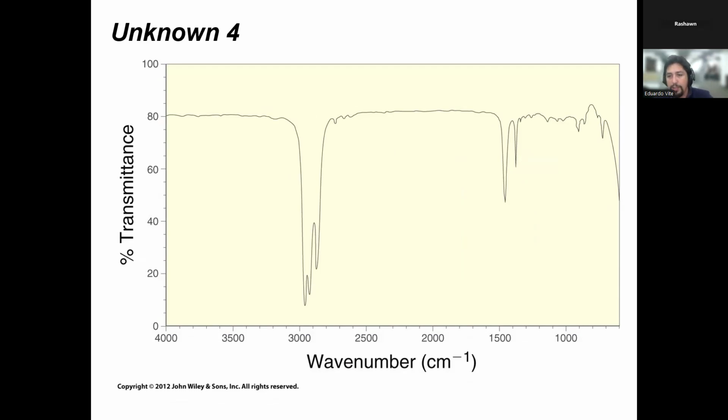So the question was, if we label these in the lab, will we get points off if we only classify the peaks that are obvious? So the thing is, we are looking for the obvious peaks because that tells us what the functional groups are. CH3 are obvious, right? Point them out. Tell me that those are CH3s because some people will confuse the CH3 peaks with the carboxylic acid peaks. Tell me that you know the difference.